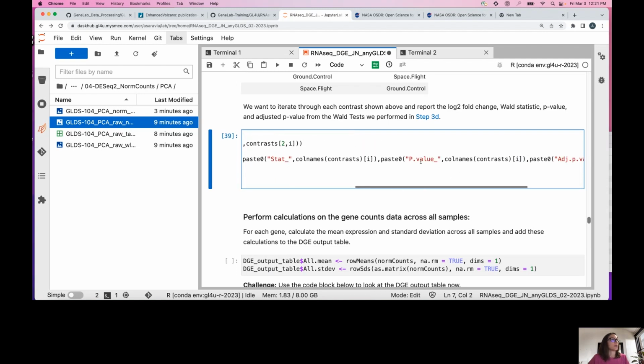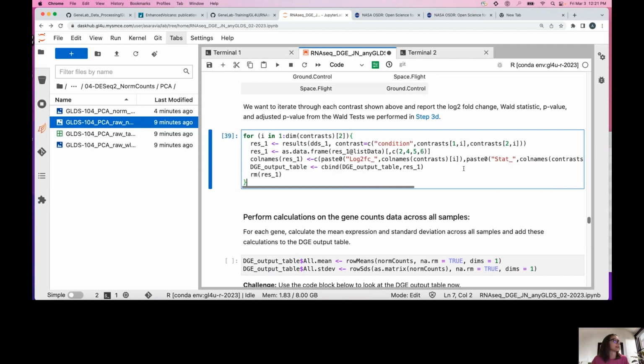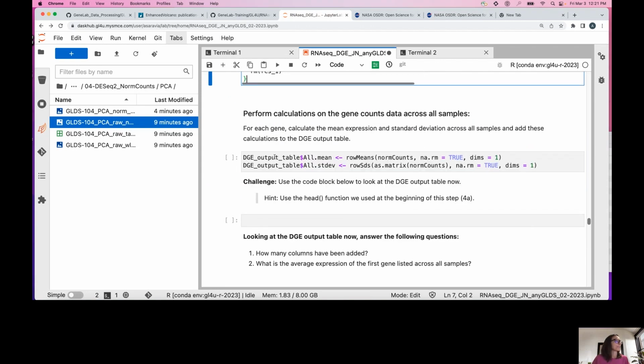And then we also pull out the p-value, which again doesn't take into account false discovery rate, which is very important when you have over 20,000 genes. That's over 20,000 comparisons. We really want to take that into account when we're running our statistical analysis. So that's why I say never, ever, ever go by the p-value to determine significance with RNA-seq data. Always go by adjusted p-value, which adjusts for multiple comparisons, since we have so many genes. But we do pull out both those columns in the table.